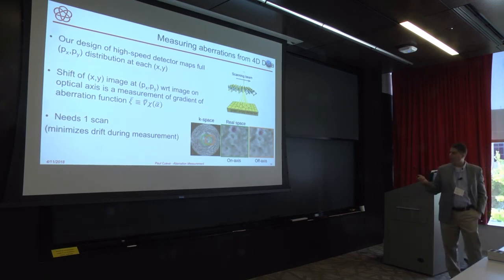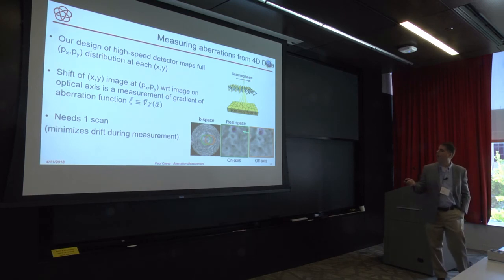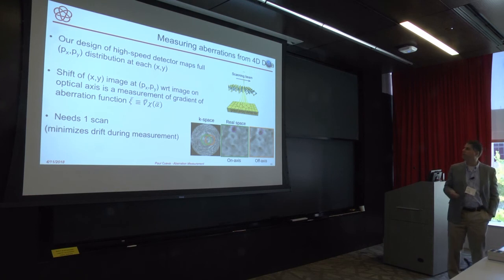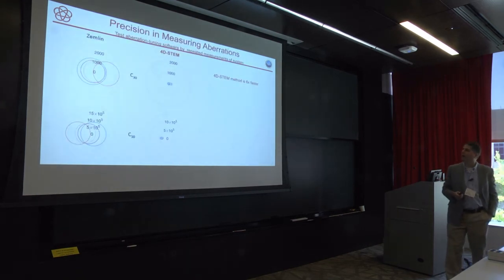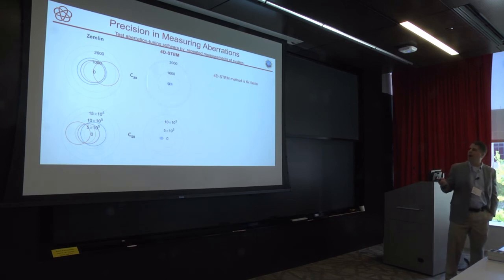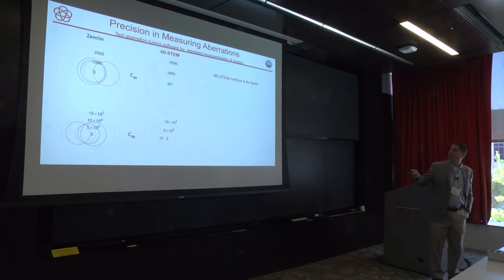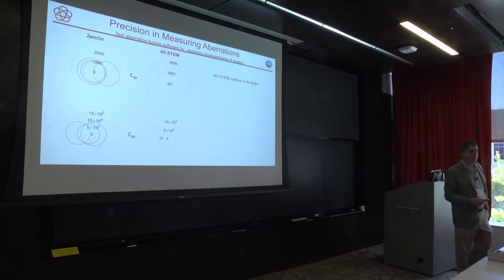And the key to making this method work is I have to be able to very, very accurately measure the shift between those two images, and those images are very noisy. So here, very quickly, is showing you the accuracy of our way of tuning versus the standard Zemlin tableau. You can see this is 6 repeated measurements. It's way, way more accurate and way, way more reproducible.